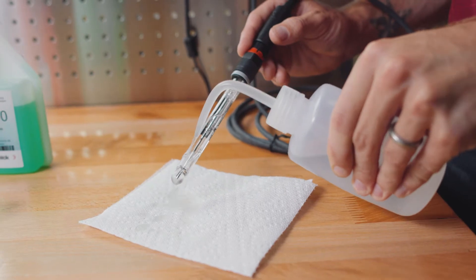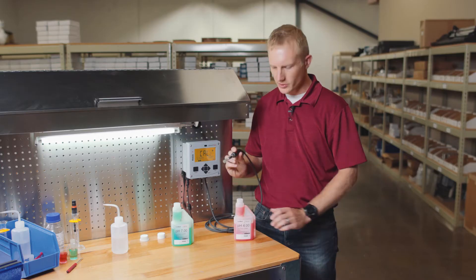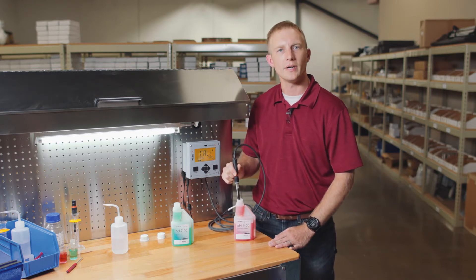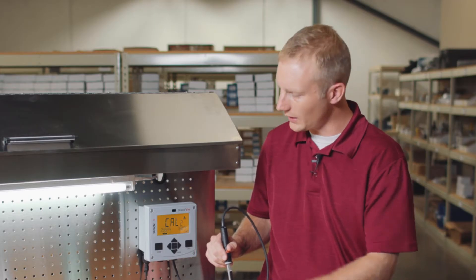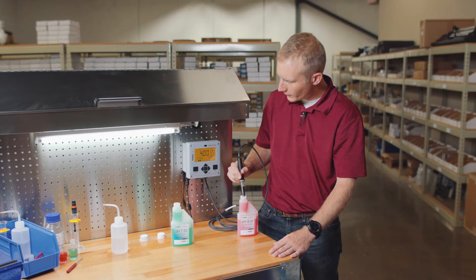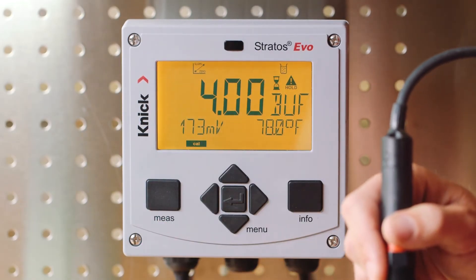We should again rinse our sensor with distilled water and dab dry. Place the sensor in the second buffer solution, stir lightly, and again ensure that the bulb and the junction are completely immersed. Just like in our first buffer solution, it's important to let both the pH and temperature value stabilize. We'll then press enter. The buffer value is automatically recognized and our millivolt value is also displayed.